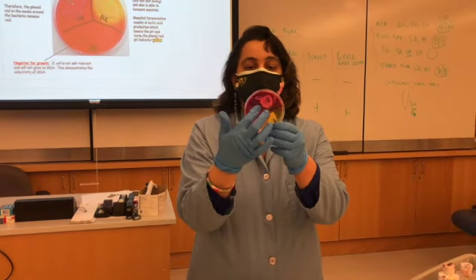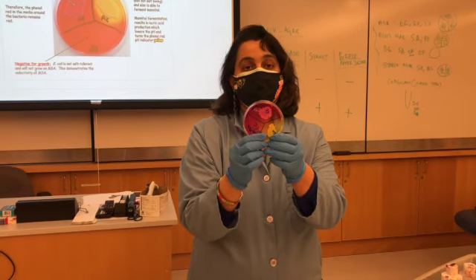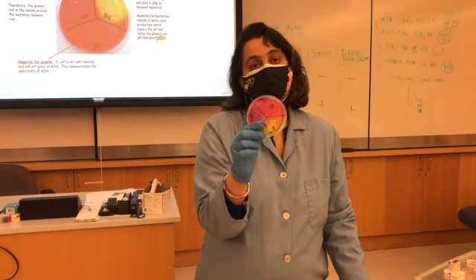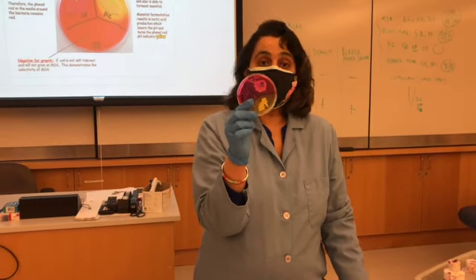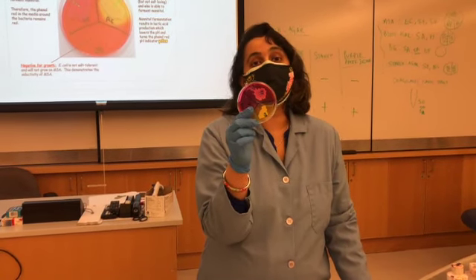Here in this quadrant, you have Staphylococcus epidermidis. Staph, whenever you hear the word staph, it's a skin bacteria. Staph epidermidis can grow on MSA plate, but it does not have the ability to break down mannitol sugar to lactic acid.